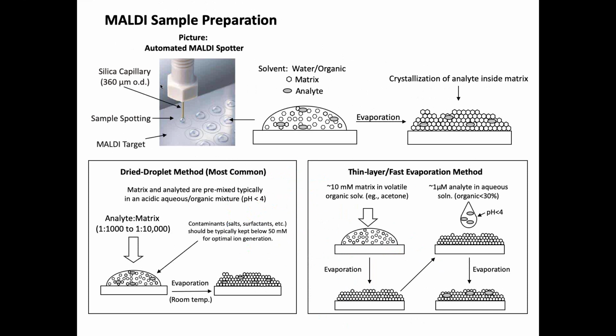But I haven't used MALDI in at least 20 years. In the old days, you had this little joystick, and you moved the laser around like you're playing Atari. That's how old I am. You're basically shooting the surface with this laser, looking at an oscilloscope, and all of a sudden you'll see the signal go up, and you're just going save, okay, I should graduate, save. So you're saving these spectra as fast as you can, but it's hard to find which ones are going to give you the hot spots or not.